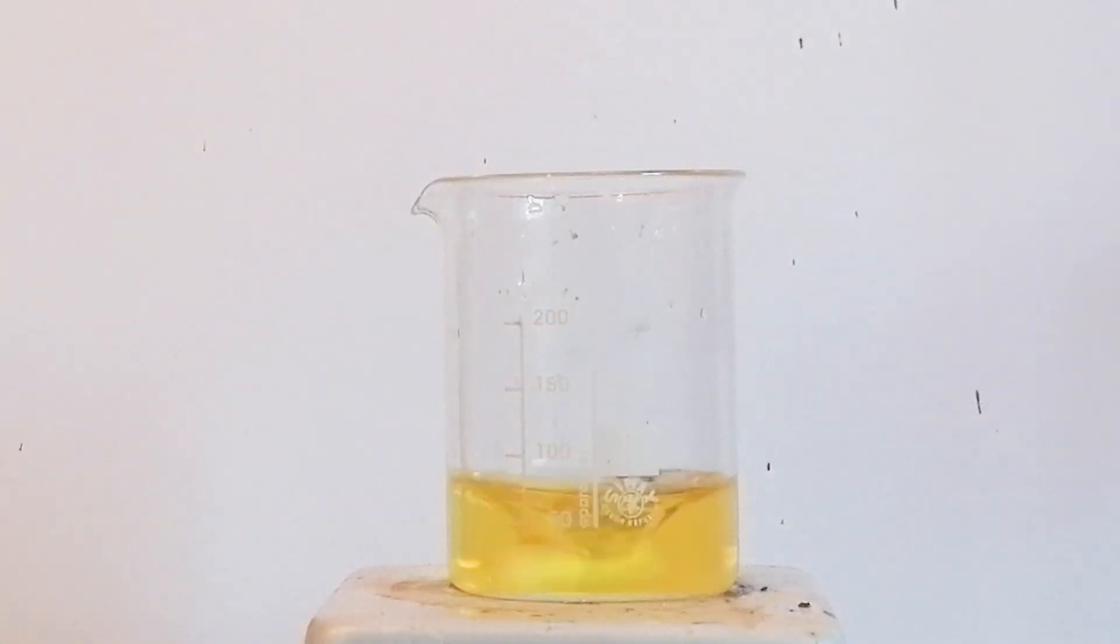After it has all dissolved, the solution turned yellow, which means that we've successfully turned some of the sodium hydroxide into sodium hypoiodite.